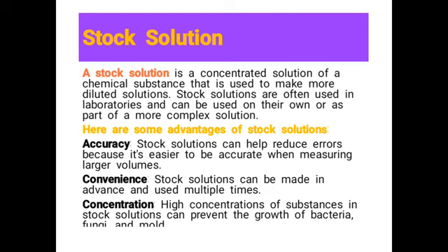Number two is convenience. They can be made in advance and used multiple times. Then concentration: a high concentration of substances in a stock solution can prevent the growth of bacteria, fungi, and mold.